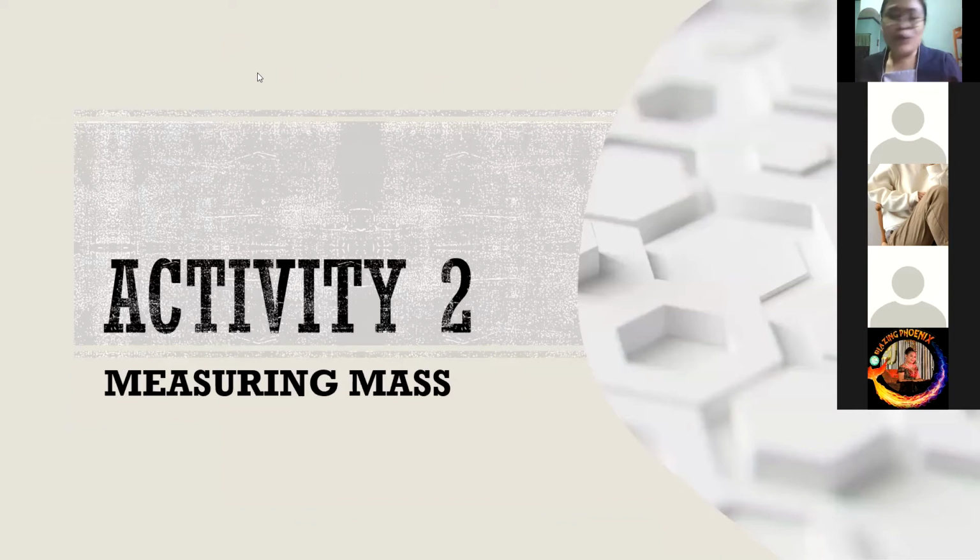Our analytical balance has a problem aside from being stained, because it lacks cleaning and we are not careful with the materials we use; sometimes the samples come in direct contact with the balance, so it got stained. Our analytical balance looks bad. At the same time, there are errors in how we weigh. Like what Rosel said, sometimes it is left open, not closed, when weighing a substance or sample.